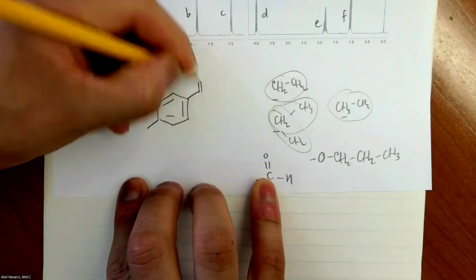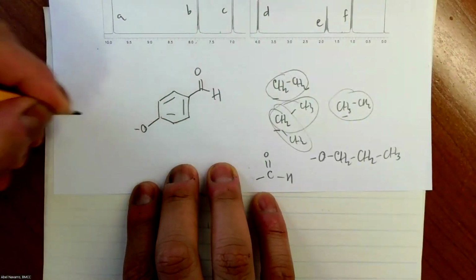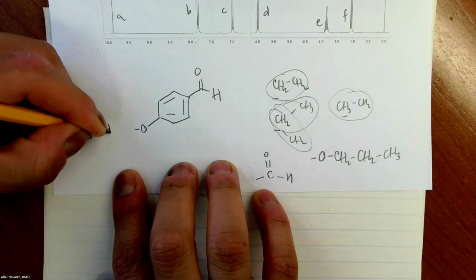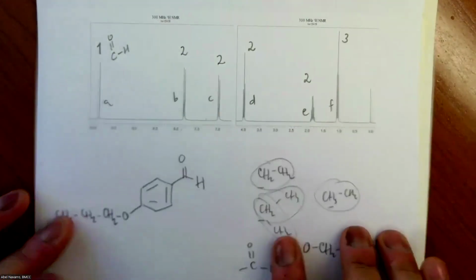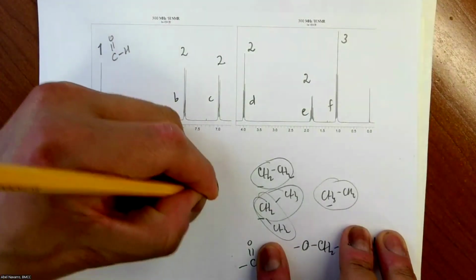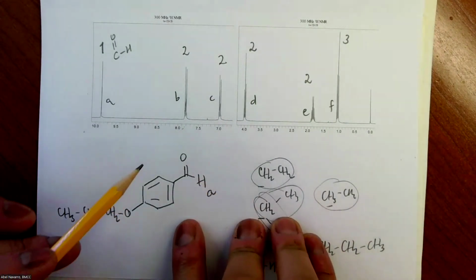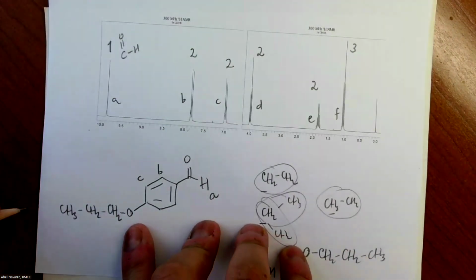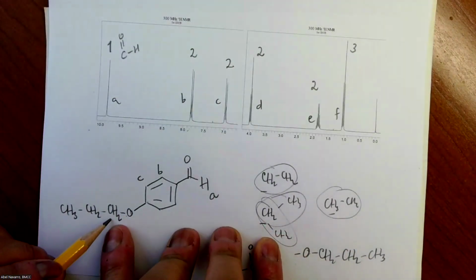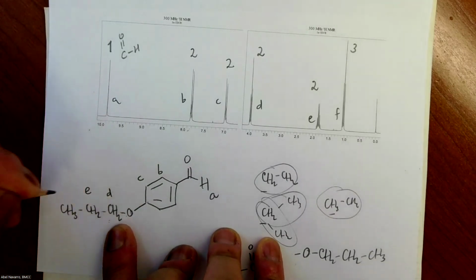So in one we'll have the aldehyde, and the other one would be CH2, CH2. Okay, the aldehyde would be A. Between the two, the most electronegative, the most electron withdrawing is the aldehyde. So this one will be B, this will be C. Oxygen, this one will be the D, E, and F.